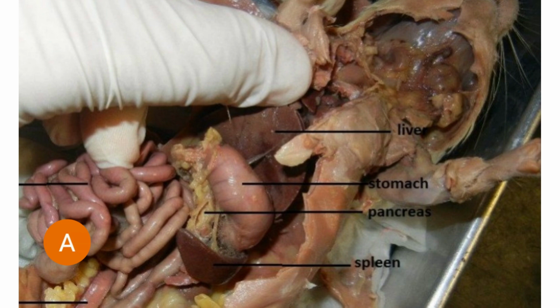Okay, so the endocrine system is made up of the pancreas as well as the spleen. So we did touch on the pancreas and show you that as well in the clip before this, as well as some of its advantages. So now we're going to touch on the spleen. Whenever we were dissecting our rabbit, we did not get a good clip and description of the spleen before we started dissecting further into and talking further into our digestive system. So I did want to show you a photo of a dissected rabbit and the spleen inside of that rabbit.